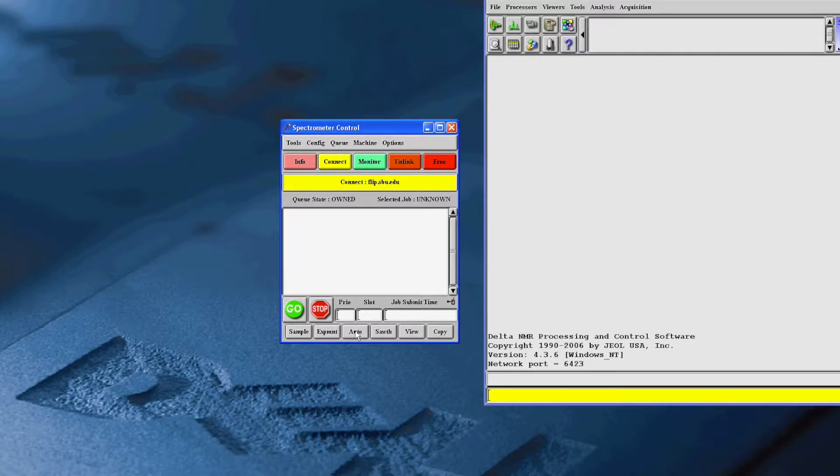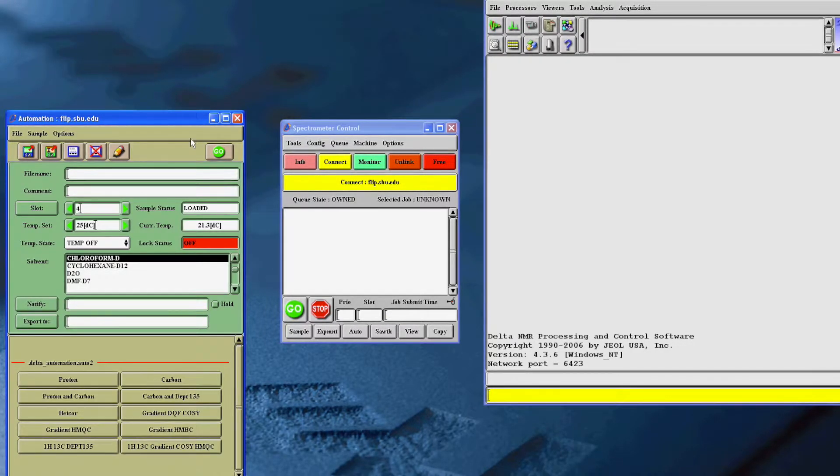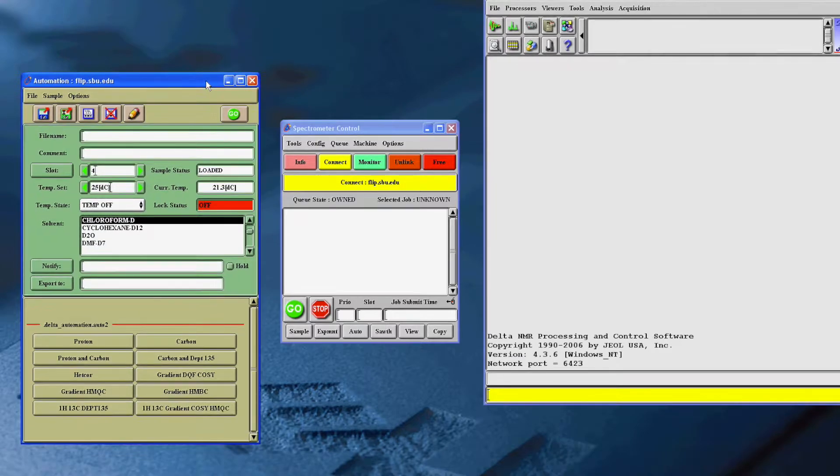Now, press the button called Auto. This will bring up the automation window where you will begin to type in your information.